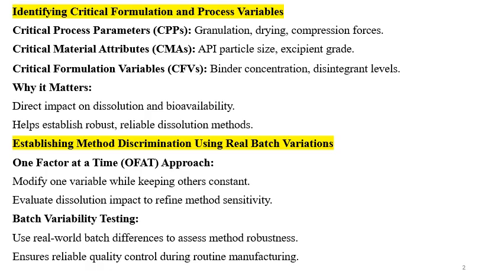This impact is required to be studied because it has direct impact onto the dissolution, and dissolution in turn has impact on bioavailability. So overall, the dissolution test gives you important understanding and information about the safety and efficacy of the formulation. It helps to establish robust, reliable dissolution methods. Establishing method discrimination using the real batch variations.